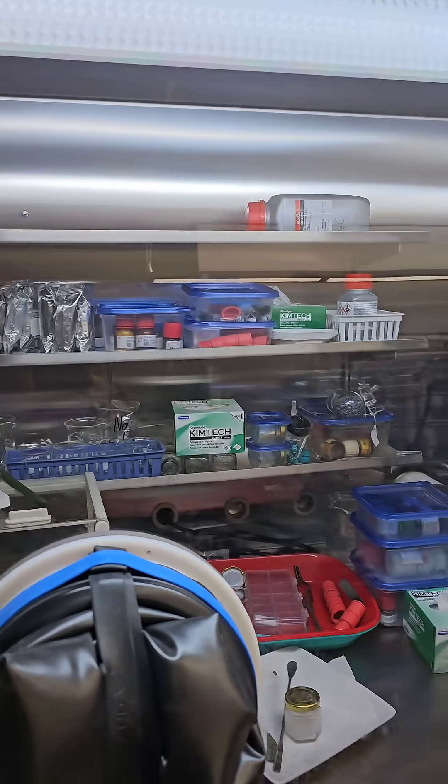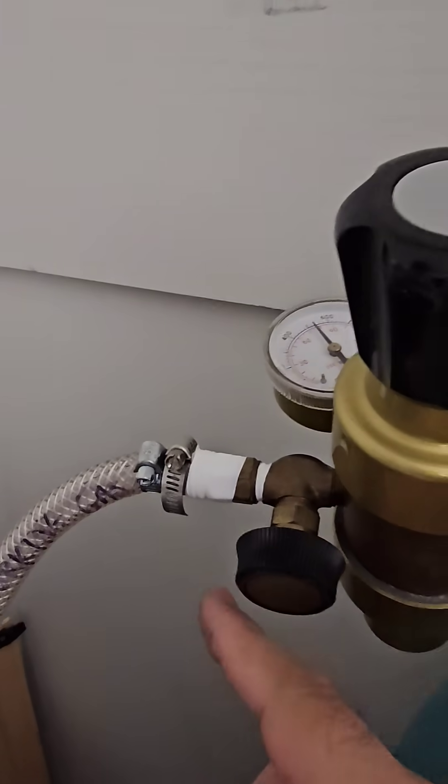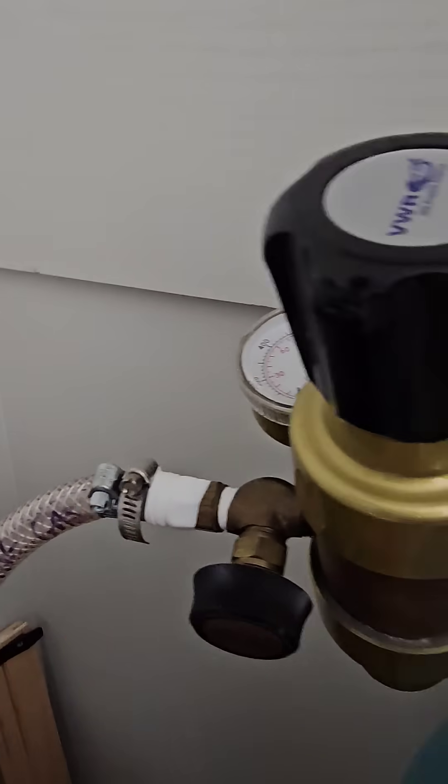For quite some time I've been trying to track down a leak. My thought process was that it was the regulator, this hose, and I tightened that bracket and tightened that bracket.